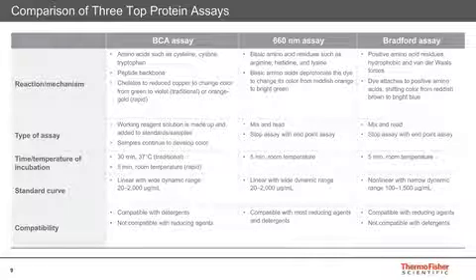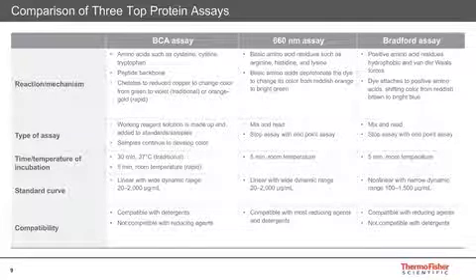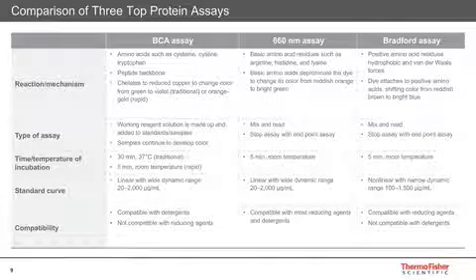The time and the temperature of incubation are also different for each of these assays. In BCA, the incubation time is 30 minutes at 37 degrees C, which has been reduced to 5 minutes with no heating with our new product called Rapid Gold BCA. I will talk in more detail about this new product in the next few slides.